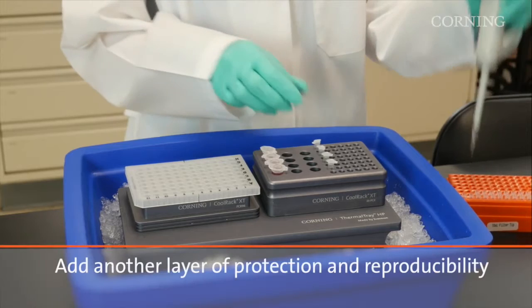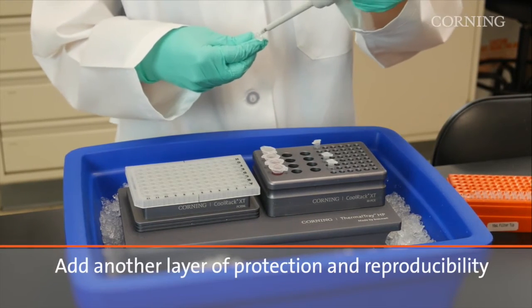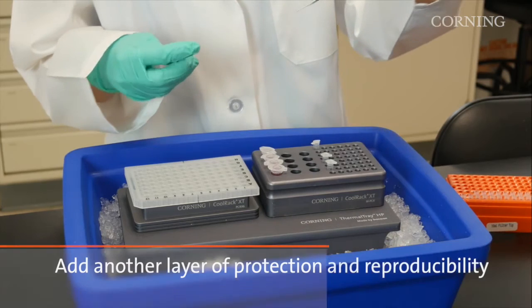To further protect your samples when working with ice, you can add a Corning thermal tray to your setup. The thermal tray further removes your samples from melting ice and contamination risk, while still giving you the benefit of cool temperatures.